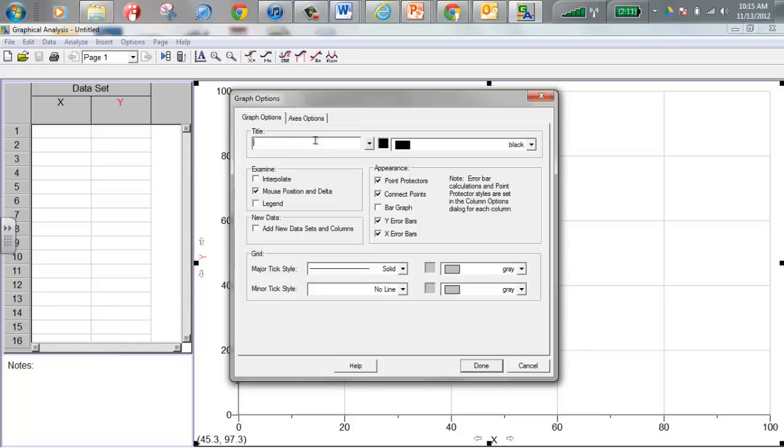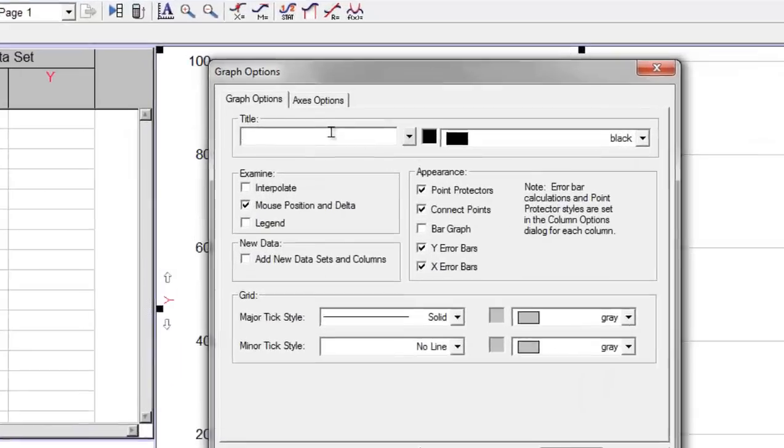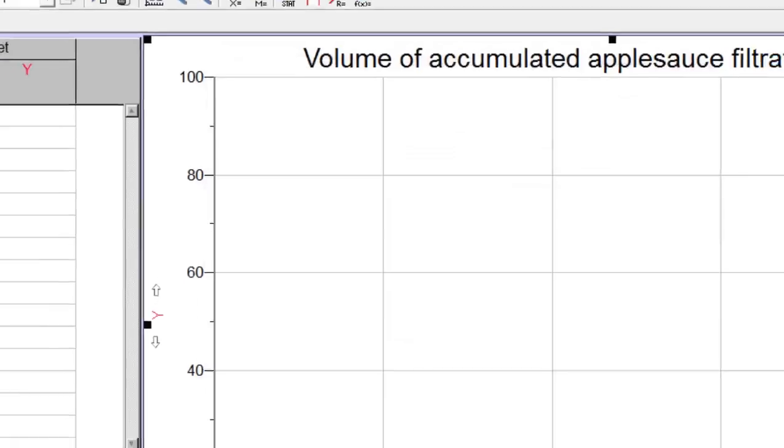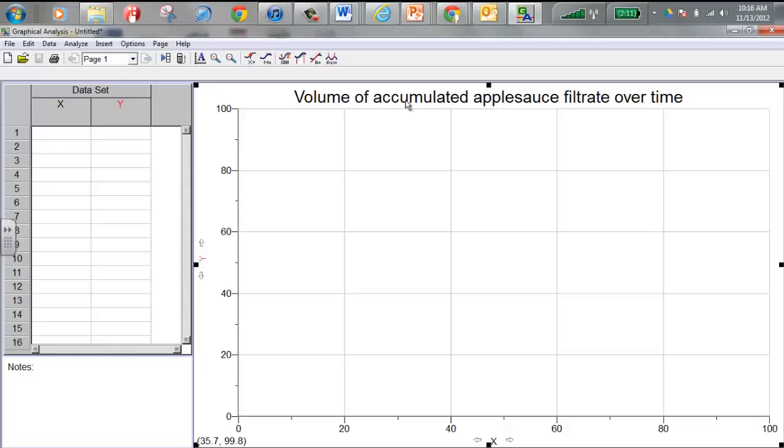A good title of a graph describes what the graph is and it relates your axis labels. Now what this is going to be is the volume of accumulated filtrate over time. Accumulated means it's accumulating, stacking up, collecting more and more applesauce filtrate. Filtrate is material that goes through a filter. This relates what the y-axis will be - this is going to be volume and the x-axis.